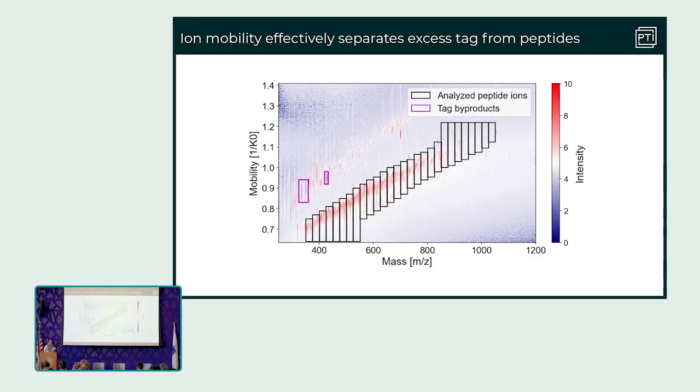Fortunately, we were able to alleviate this using ion mobility to effectively separate the excess tag from the peptides.